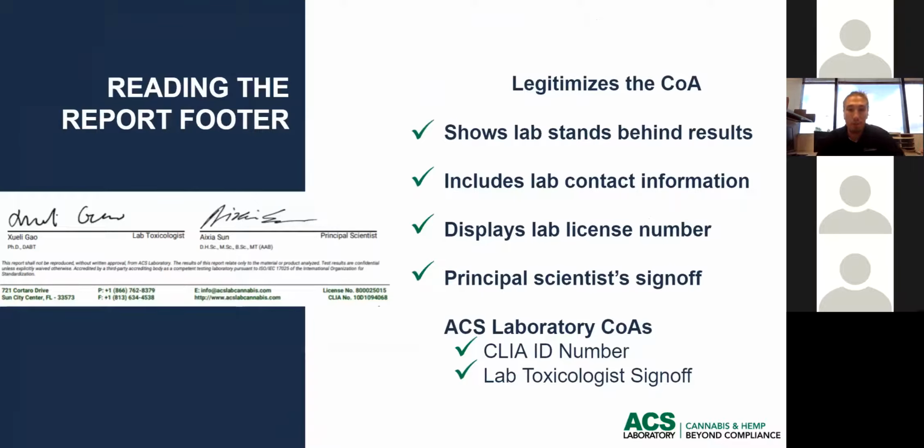The last portion of the COA is reading the footer, and this is going to be big for legitimizing the COA. This is your way of showing that the laboratory stands behind the results, that they're signed off on, that the laboratory puts their information out for any questions about the COA, and that they're willing to stand behind those results.